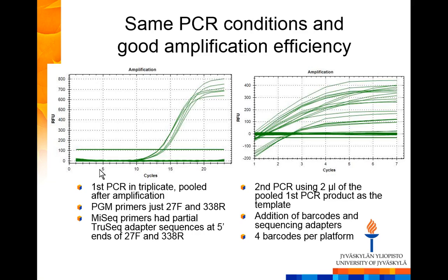One point is that you don't necessarily need to run a gel. When you have a known protocol, and you have worked with the primers before, you know they should work, and there shouldn't be a very big problem with primer dimers or anything. So when I see this kind of amplification result, I don't bother nowadays ever to run a gel, because it works fine. Another thing is that if you put in the same amount of template, you would hope your samples start to amplify at about the same time, which is what you would want to see.